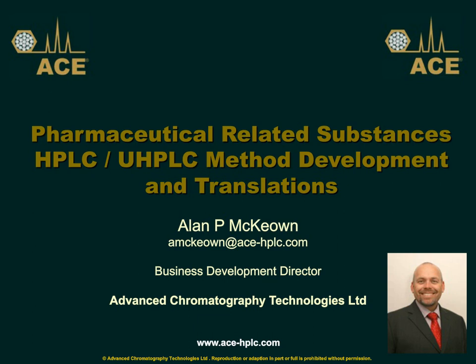pay to access. So what I've tried to do here in this seminar is describe from a first principles perspective, using the concepts of chromatography, to help people understand why the method is what it is and how it can be developed relatively simply to give you the answer quite quickly based around selectivity.